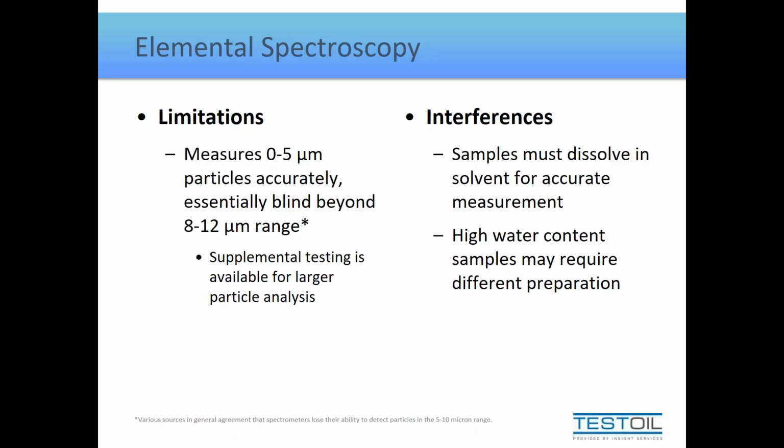Now, some people will state that the test is blind. I say it's essentially blind. The particle is measured, but it's not measured to quite the same extent that it should normally be measured. The analogy I like to use is, imagine if we were quantifying a meteor shower.